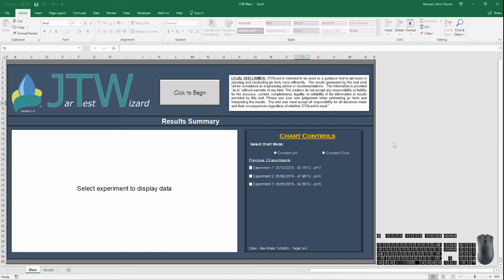We created another video that focuses on the theory of jar testing, and we show you in that video how to actually perform a jar test, so I would recommend watching that first if you haven't already done so.